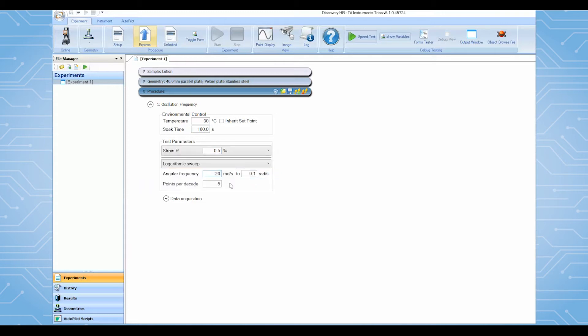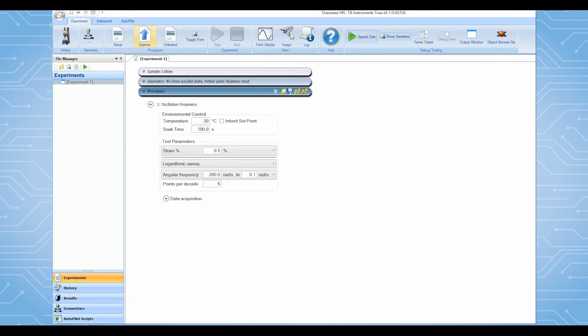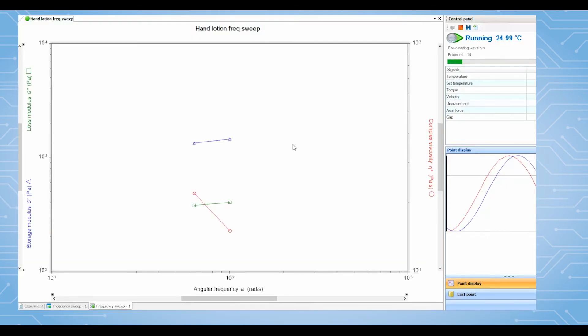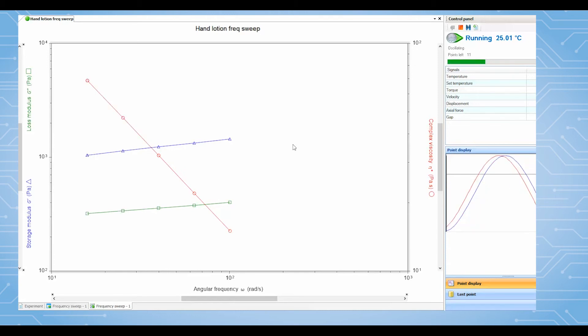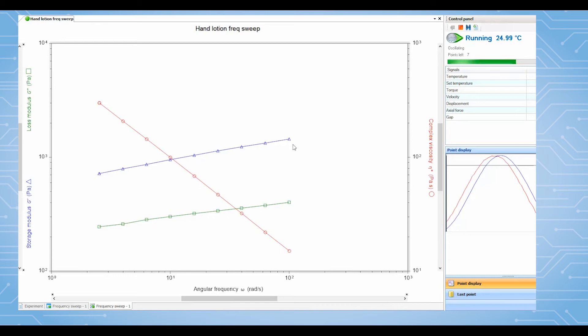After the test is started, TRIO's will plot the results showing G prime and G double prime on Y1 and complex viscosity on Y2 versus frequency in log-log scale. Frequency sweep experiments are commonly used to evaluate and compare the viscoelastic properties of samples with different formulations or polymers with different molecular weight or molecular weight distribution.